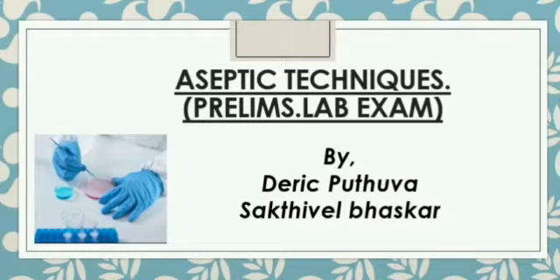Okay, so let's begin our discussion with the definition of aseptic technique. In simple terms, this is a method that prevents the culture or the sterile media, etc., from microbial attack or microorganism attack. It is also called sepsis control, and sometimes this action is called aseptic technique. The main goal of the biologist is to grow a microorganism or a bacteria, in this case, successfully without microbial attack. So, aseptic technique ensures this. But remember, it is technically impossible to make a completely sterile working environment. Yes, it is not possible, or it doesn't even exist.